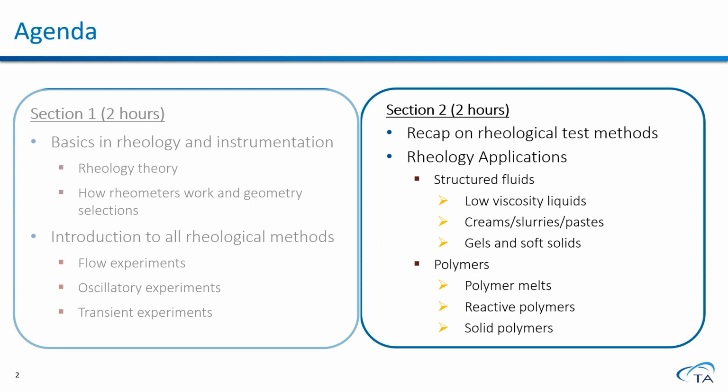Specifically, we'll talk about rheological applications in measuring structured fluid that include low viscosity liquid samples, semi-solid samples, and soft gels. And then we're going to talk about rheological applications in measuring polymers, which include polymer melts, reactive polymers like thermosetting polymers, and also solid polymers.